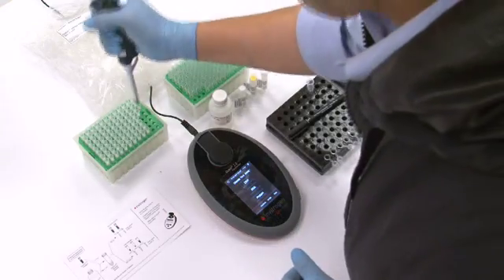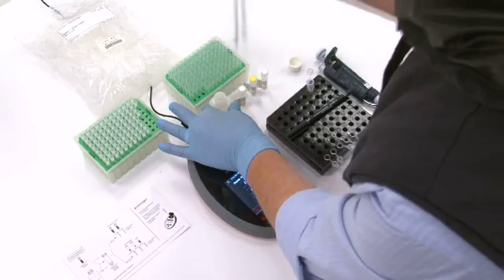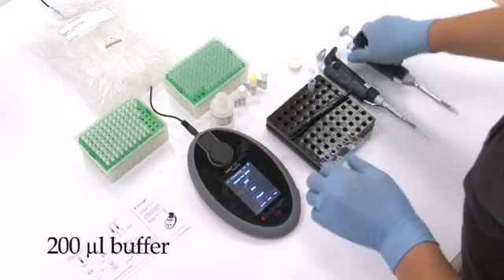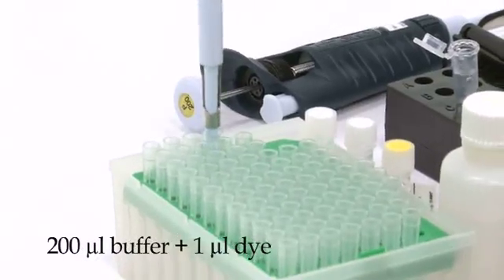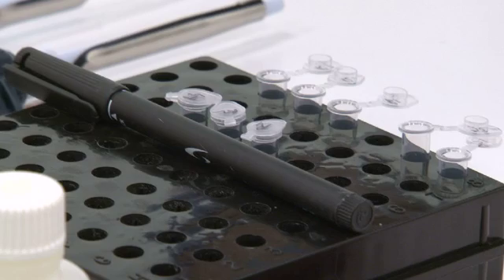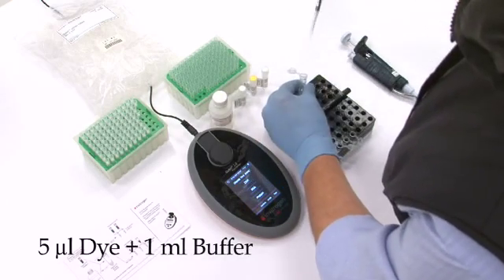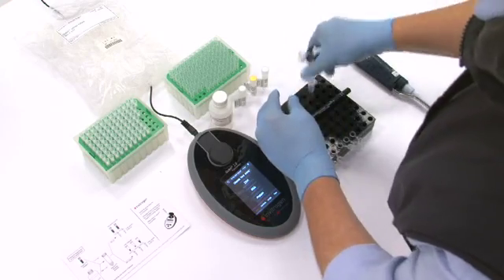The basic Qubit protocol is simple and shouldn't take more than two minutes. The first step is to prepare the working solution. Use 200 microlitres of buffer for each tube and 1 microlitre of dye for each tube. Because we have 5 tubes in our DNA quantification assay, we will need 5 microlitres of dye and 1 millilitre of the buffer. Mix the dye and the buffer in 1.5 millilitre microtubes.